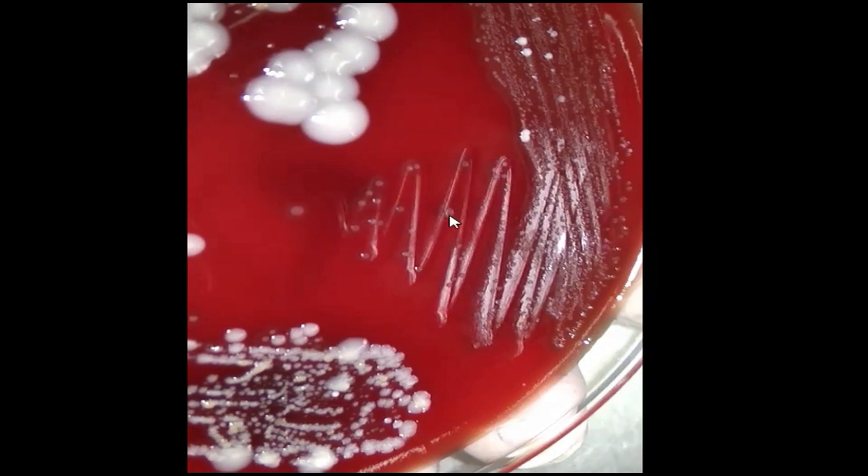Here you can see the depressed center and elevated ring. That is why this colony is a draughtsman's colony.